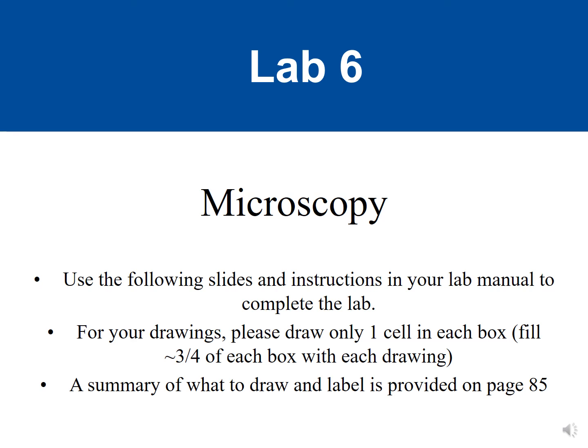In this video, we're going to talk about Lab 6, which covers microscopy and mitosis. And so what you're going to do for this lab is you're going to use the following slides and instructions in your lab manual to complete your lab.